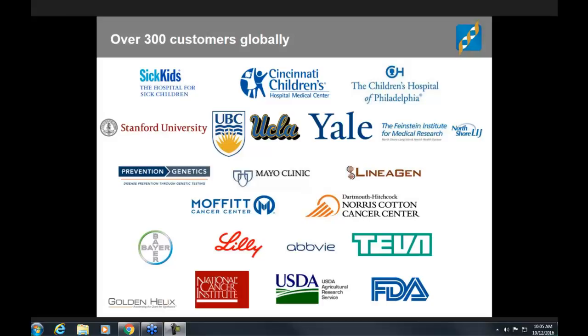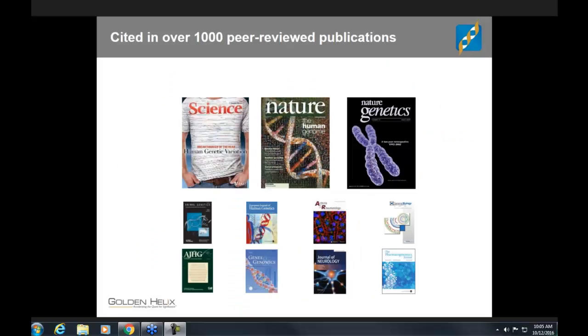And so today we're going to be talking about this method, and the data that we'll be using later on, we'll mention, was provided by our customer at PreventionGenetics. So this is real clinical data with validated results that we're able to use to build something like this that is going to be applied in a clinical setting.